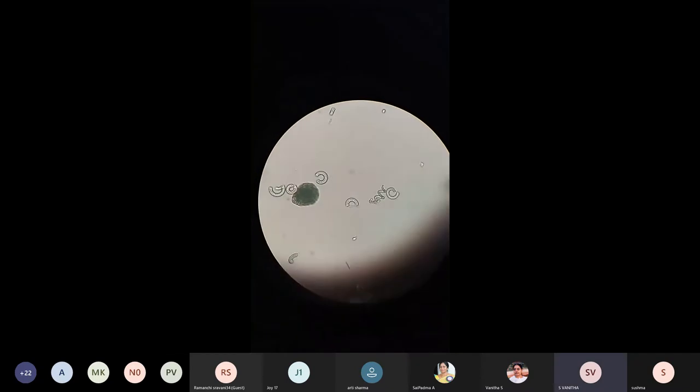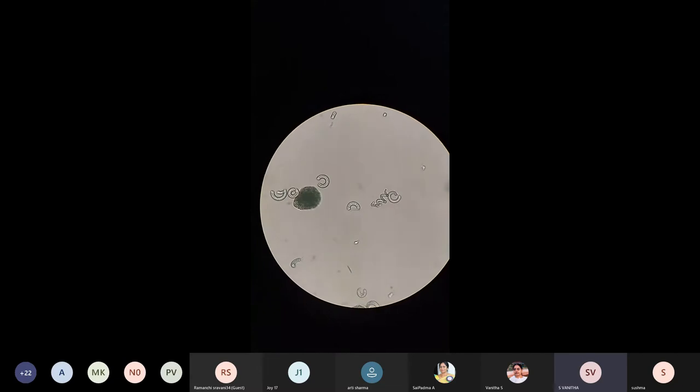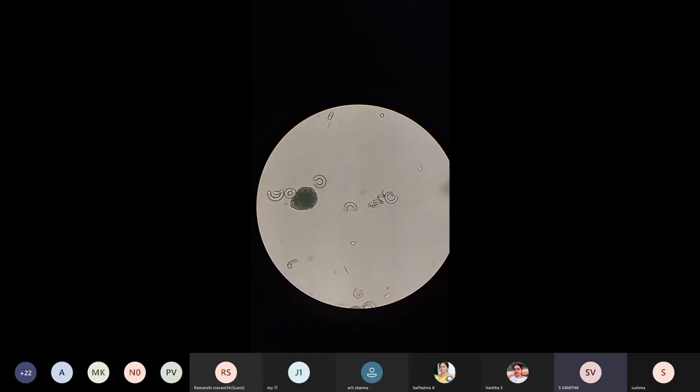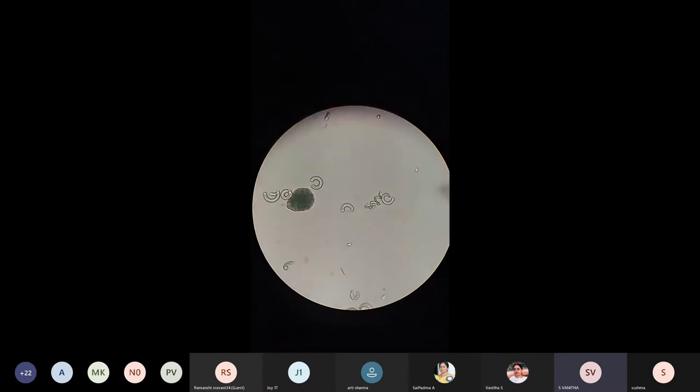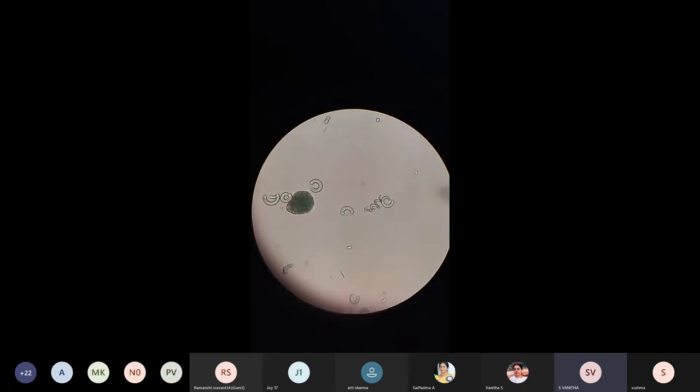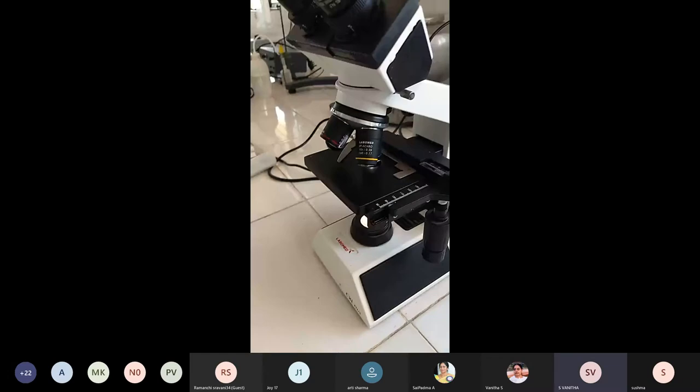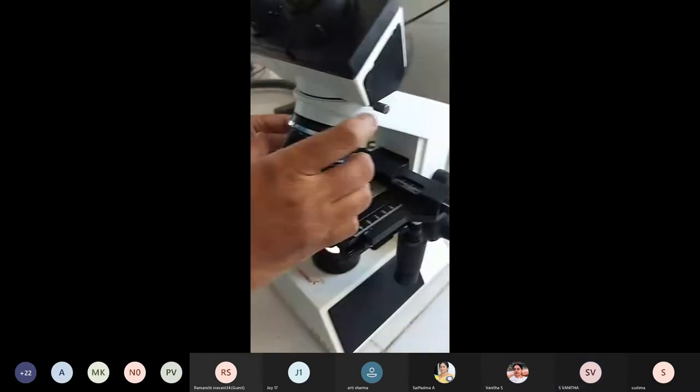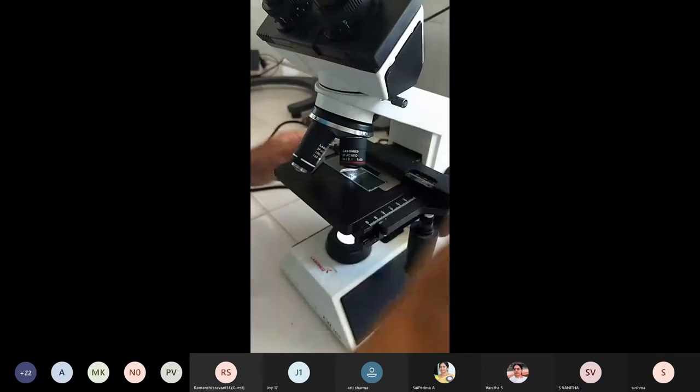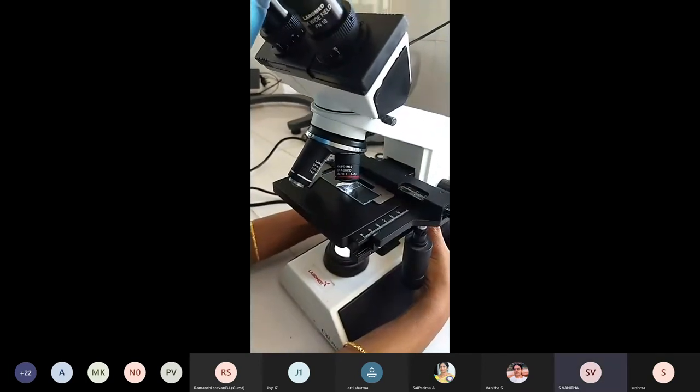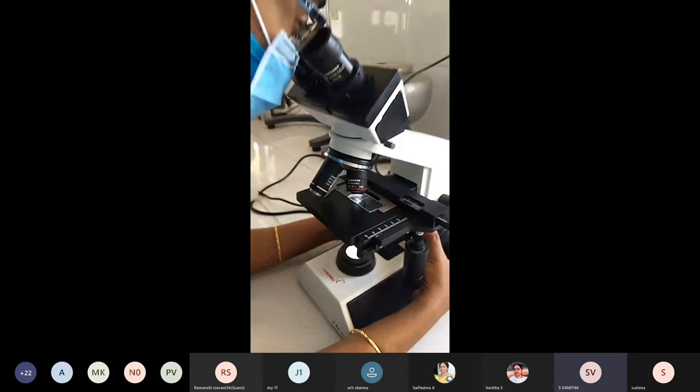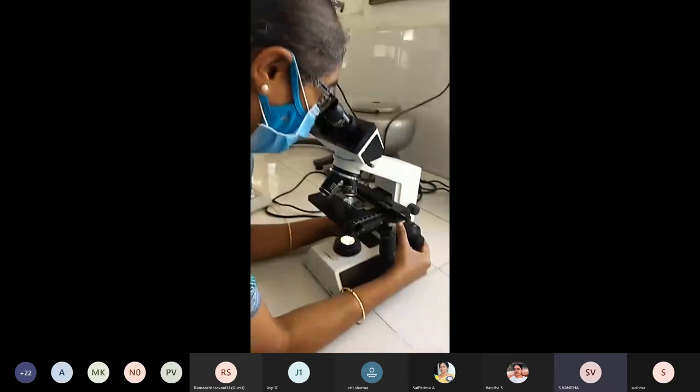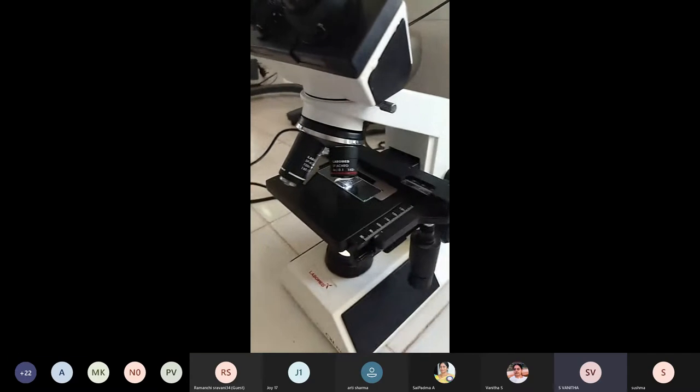Now in 40x only, I am focusing it for you. 100x is not needed here. So this is yeast. Many of them are started to do budding also. You can observe. This is at 10x. I will show you later at 40x. Magnify it at 40x and show you.